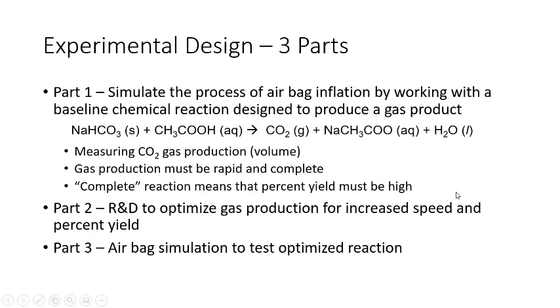Hello, today's video is a pre-lab lecture for the airbag lab. So the airbag lab is an experiment that takes part in 3 individual parts. Part 1 is where we're going to simulate the process of airbag inflation by working with a baseline chemical experiment that is designed to produce gas as a product.